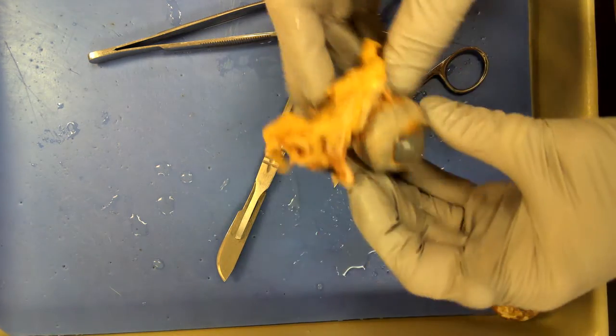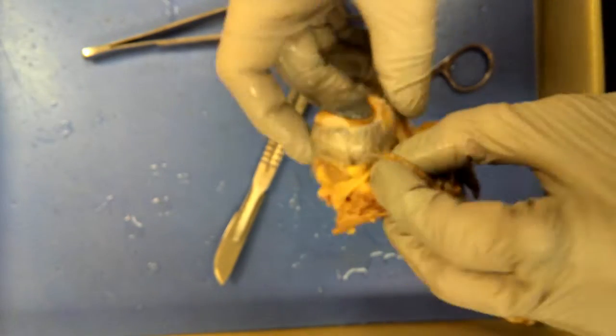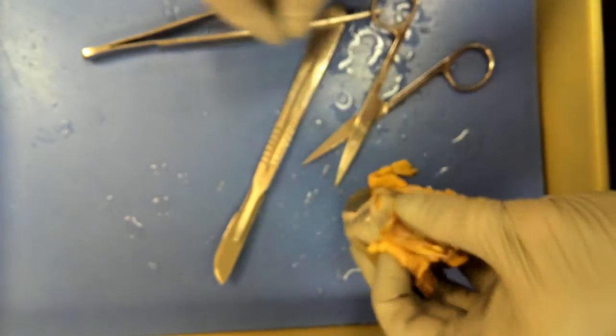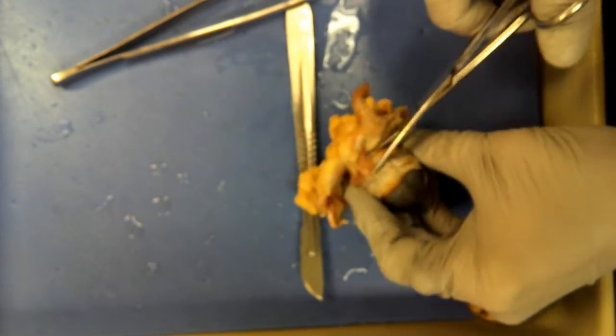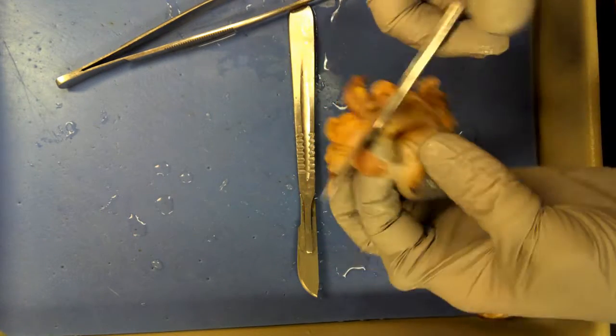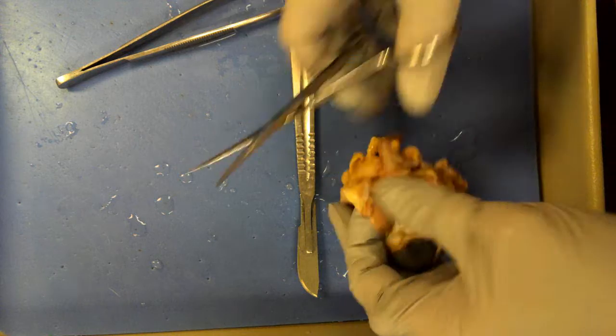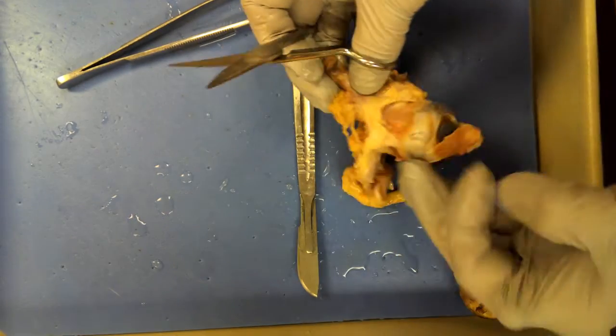I'm going to show you some of the technique here. The sclera, which is the white part, doesn't look very white, but it is very tough. For this dissection, being too careful will make you take forever. By the way, that's a rectus muscle — it looks to me to be the inferior rectus muscle.